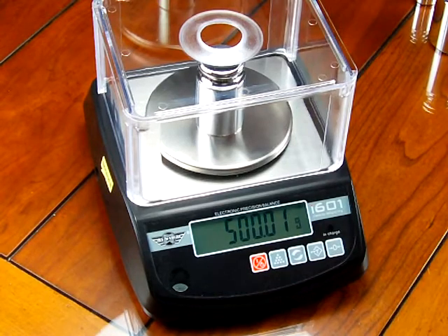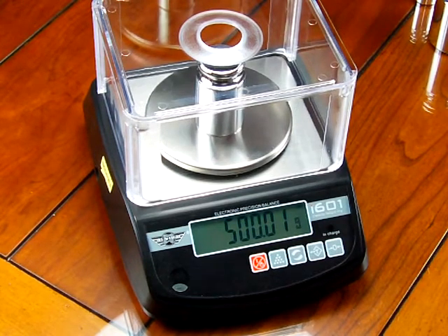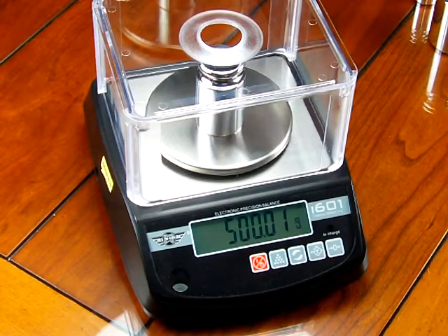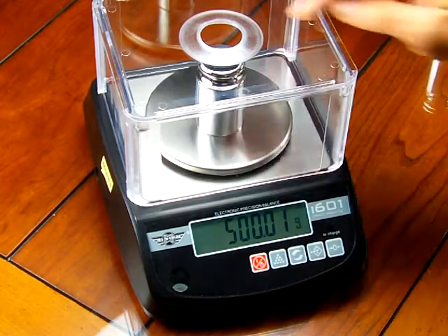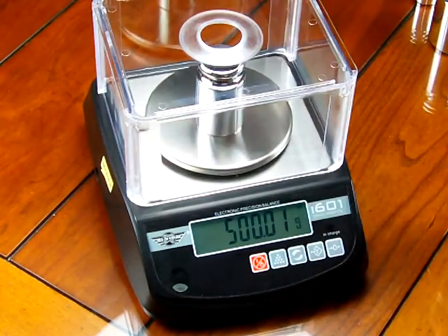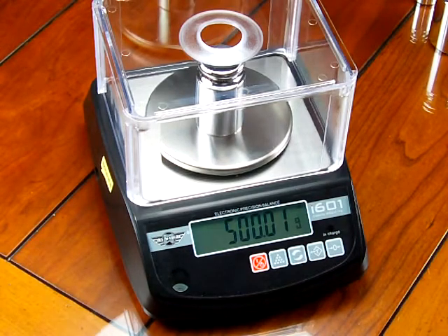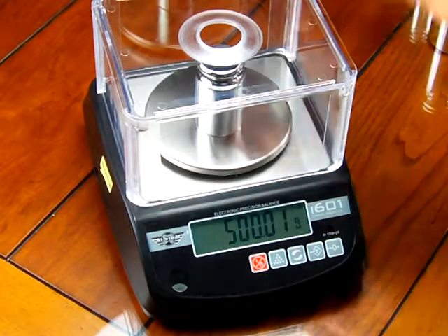So again, this is a very affordable balance targeted to, we'll say, the school market that has a limited budget. And here, they're giving you all kinds of nice features. I mean, there's a hole in the top here. So, a student, if they had a burette, and they were trying to dispense the liquid, they could do that right through the top.